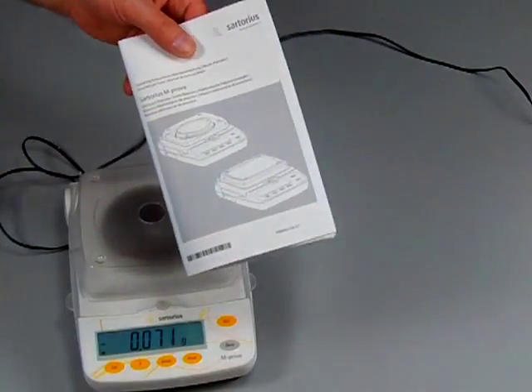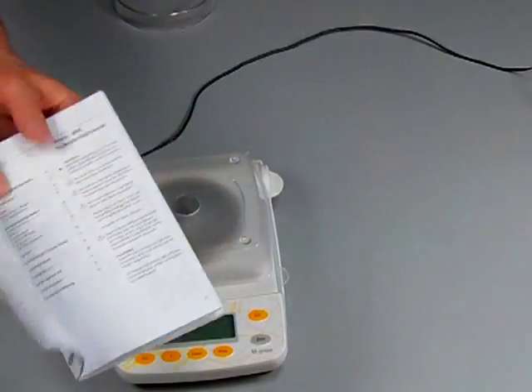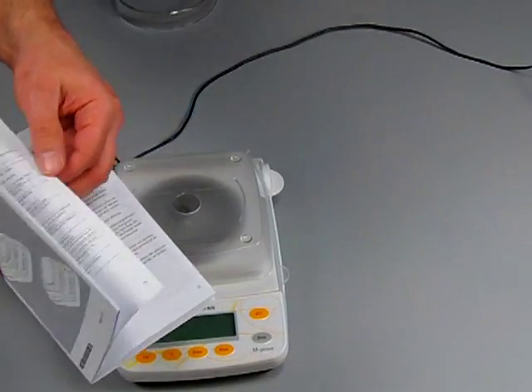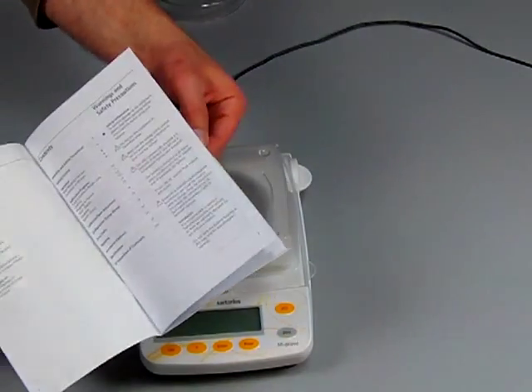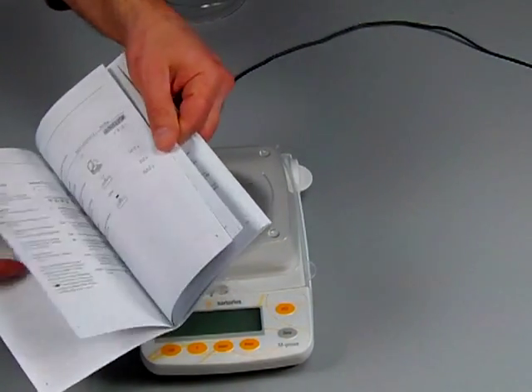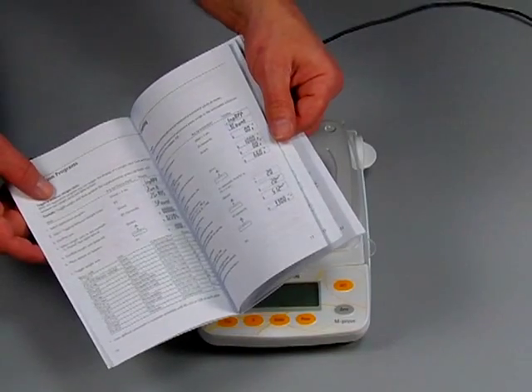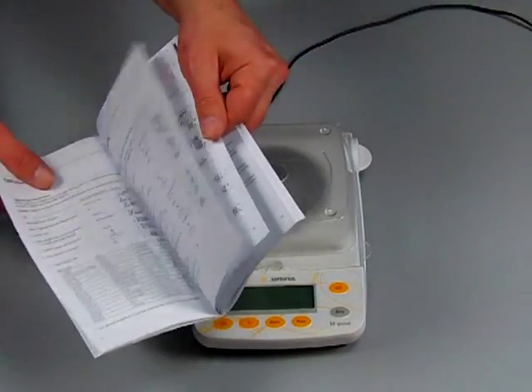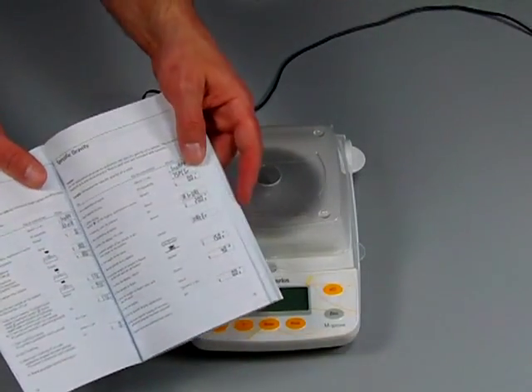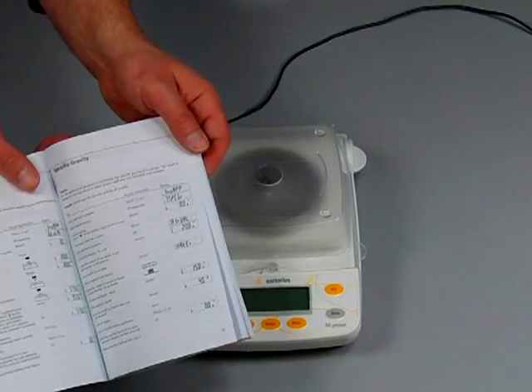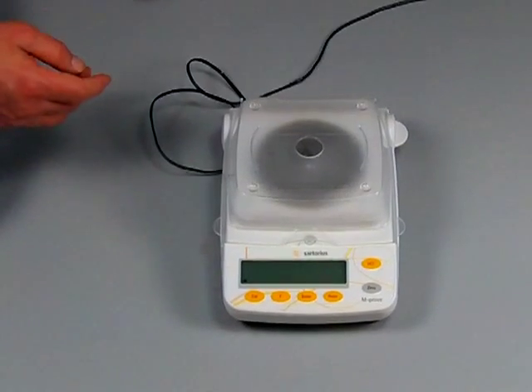We just want to tell you, don't be afraid when you get the manual. Do read it, but don't worry, you don't have to read the entire manual because it's only 22 pages. And you can download this user manual from our website. It talks about the configuration, the setup, and how to change weigh modes. Again, on a scale like this, you can only toggle between two weigh modes. If you've had other Sartorius products, you'll know how to use the scale right away. If you haven't owned a Sartorius product, you definitely want to read through this manual to get a better understanding of how the scale operates.